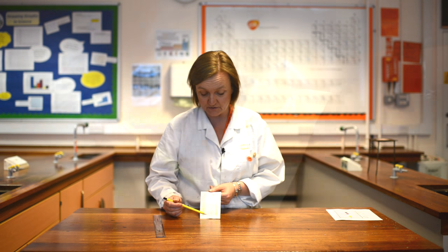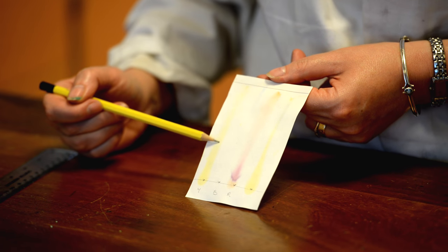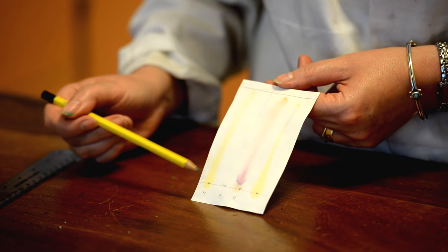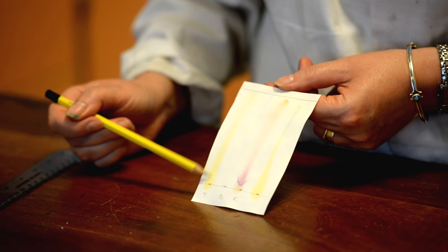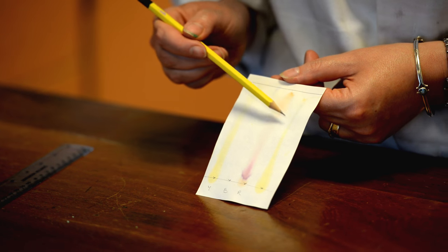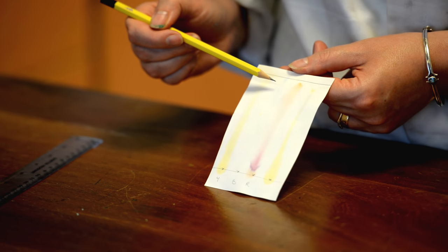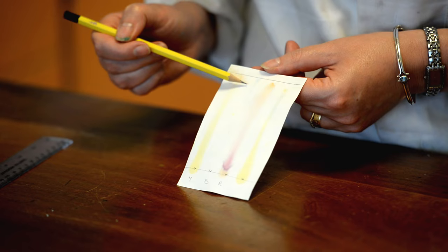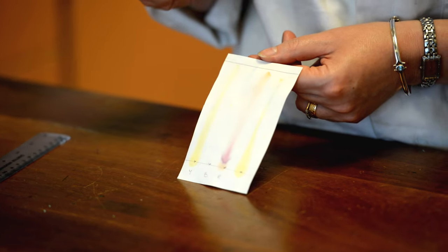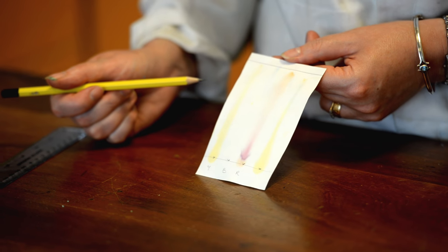Now straight away you can see that our unknown is very clearly showing that it contains the yellow, because just by visual inspection you can see that you've got that similar pattern of the yellow color. You'll also see that it's got this darker part at the top here which coincides with the blue food coloring, because you can see that's made its way all the way up to the top of the paper. So this unknown food coloring was a mixture of the yellow and the blue, and we've separated those out.